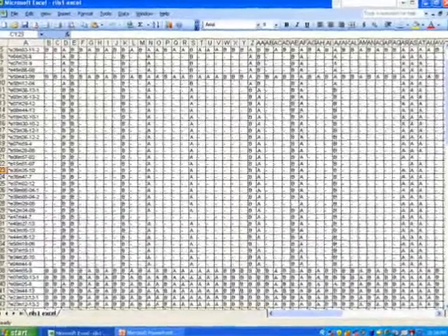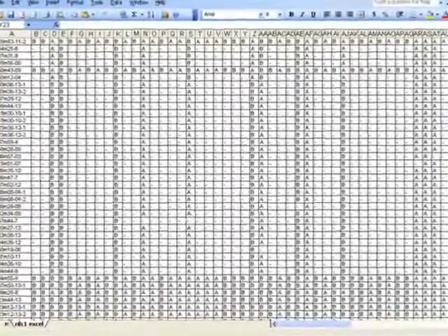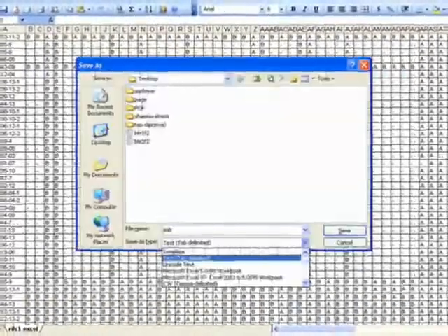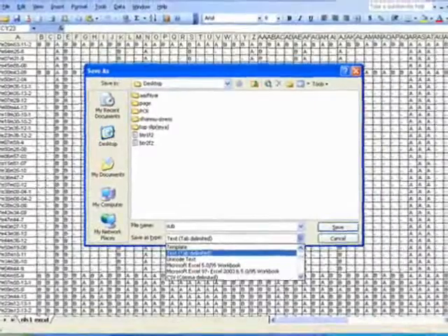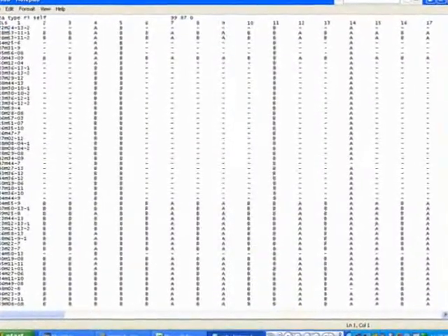Marker data is generated in an Excel sheet. The scoring is based on the resemblance to the parents, whether A or B. It is saved as text format using tab-delimited text.